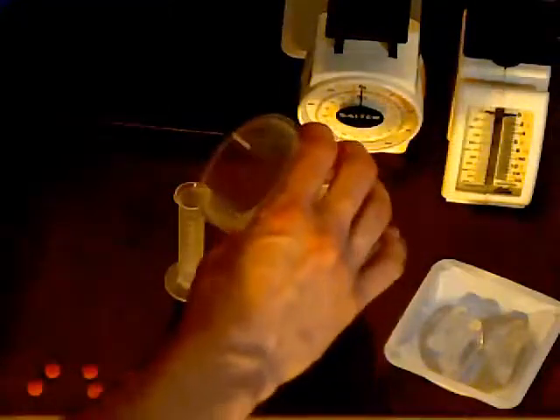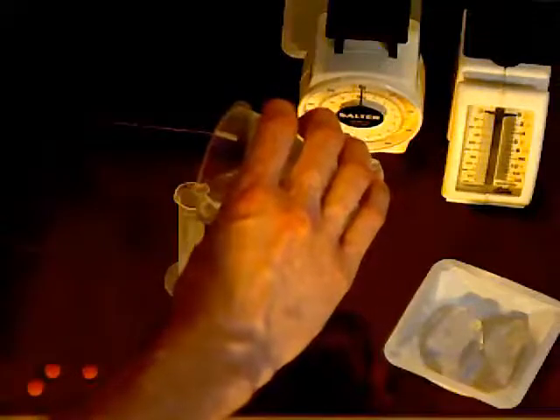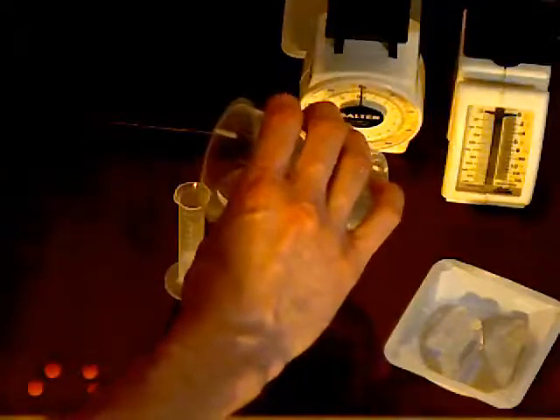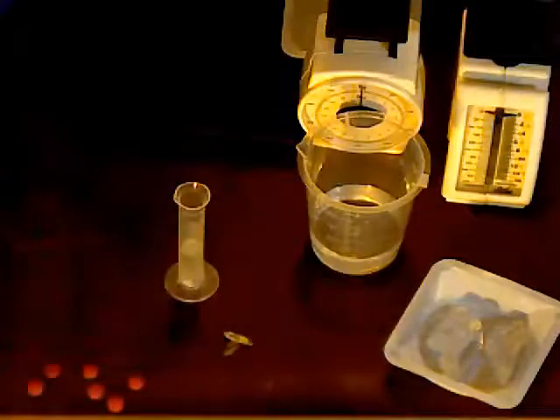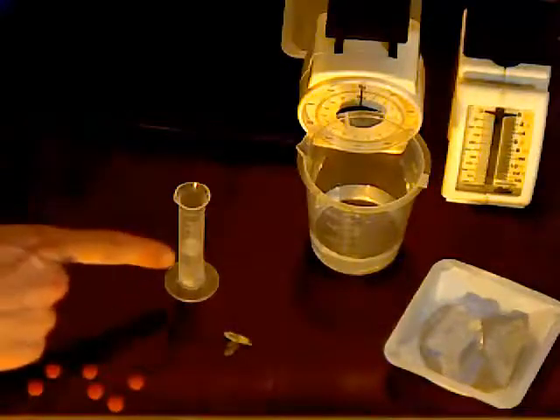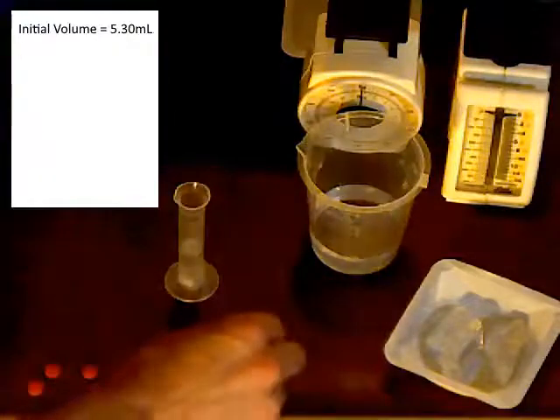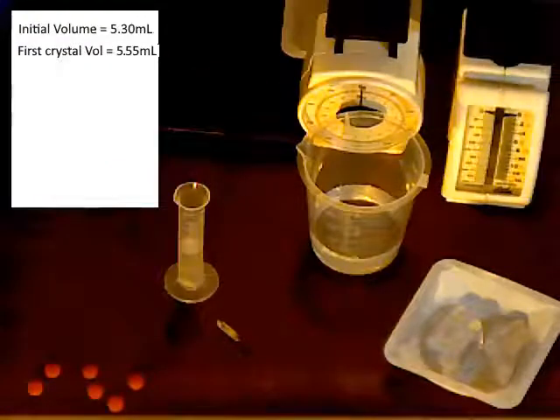To do that, I will use a graduated cylinder that's more appropriately sized for those. And I fill it up with a small amount of water. I don't want to get it all the way full or not full enough. Here I can make my initial measurement by looking at the lines, and then I can add my first crystal very carefully.